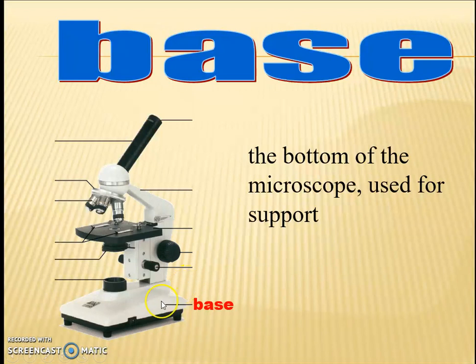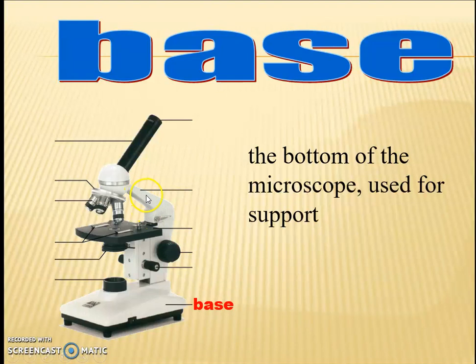The base is the bottom of the microscope, used for support. When you pick the microscope up, you hold it from the arm and place your second hand at the base — that is the proper way to carry the microscope.